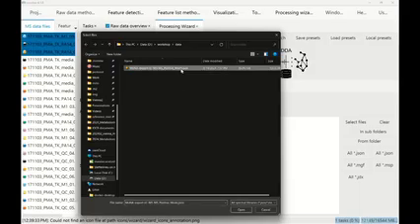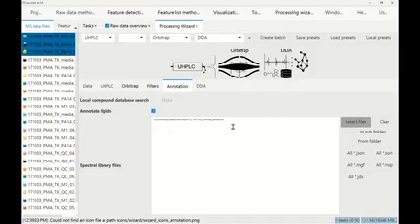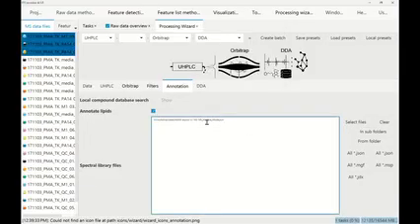JSON is a very general format, and this is the JSON format from MassBank of North America that we support here, but also from GNPS, from MZmine, so there are multiple different library formats. MSP and MGF as well, MSP for example from NIST search. So we select this file here, and you should see the full path in annotations.